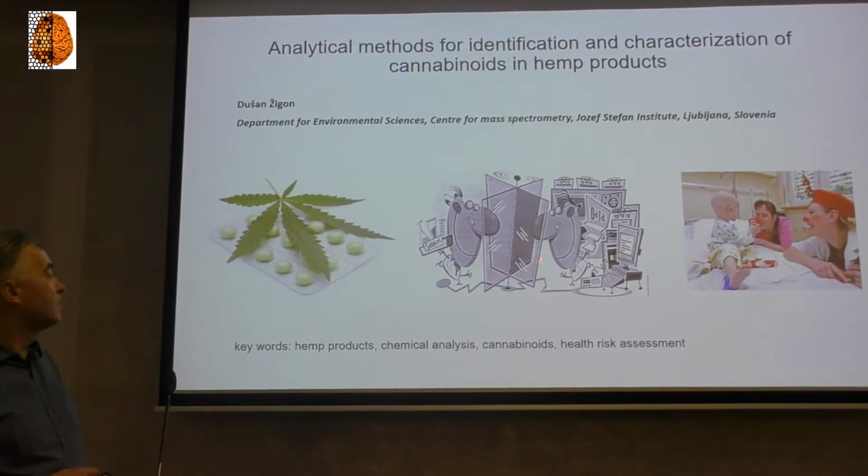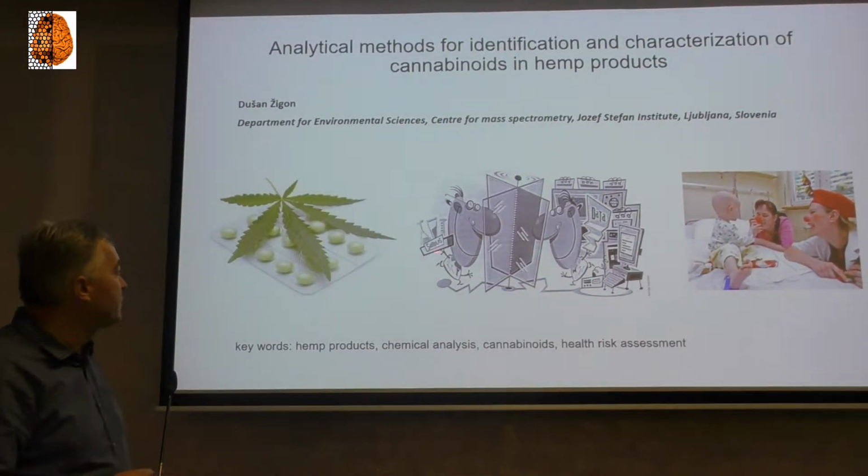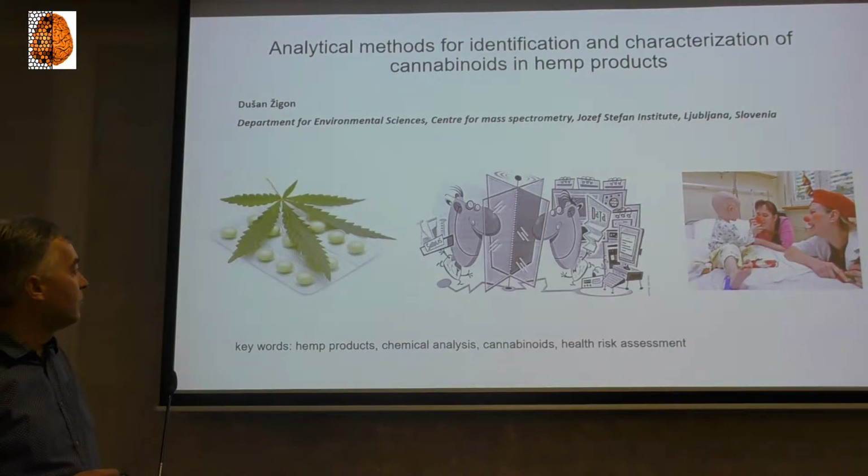The starting point is the sample. Then we have the analytical procedure, usually with chromatographic or spectroscopic techniques, and many results are formed after the method.